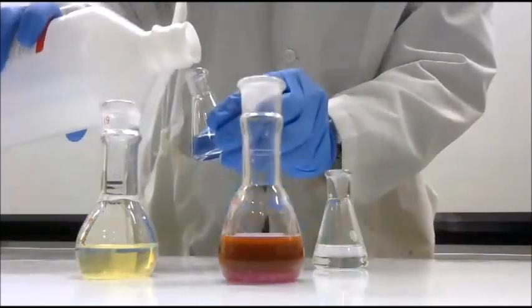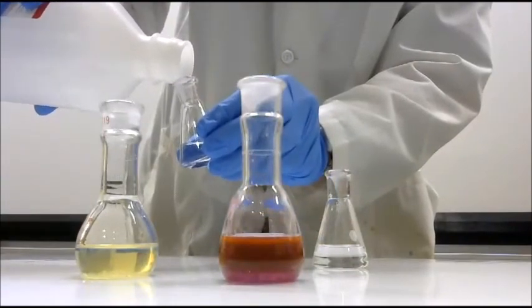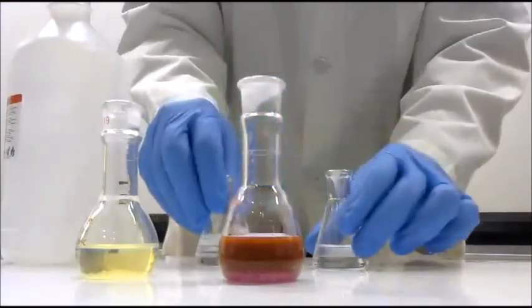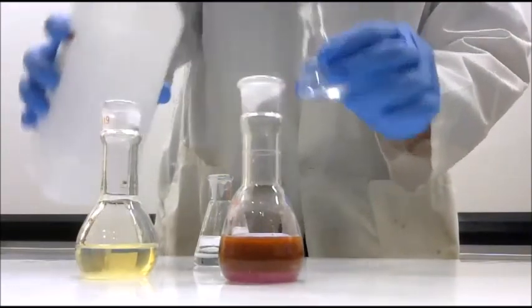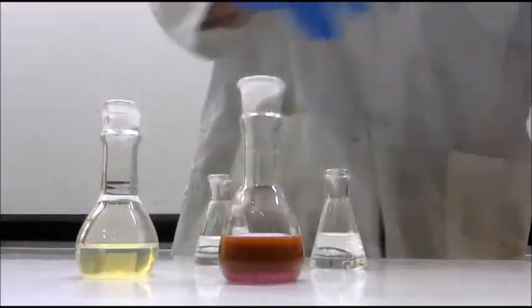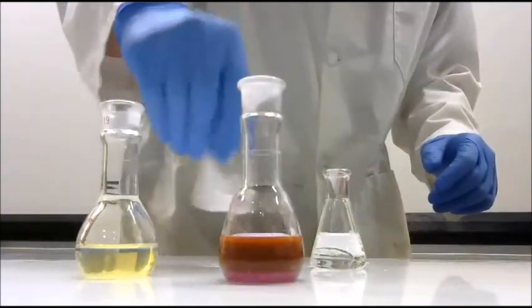So we're going to put some of this hydrogen peroxide in here. And then we want to make sure that it gets mixed up very well.